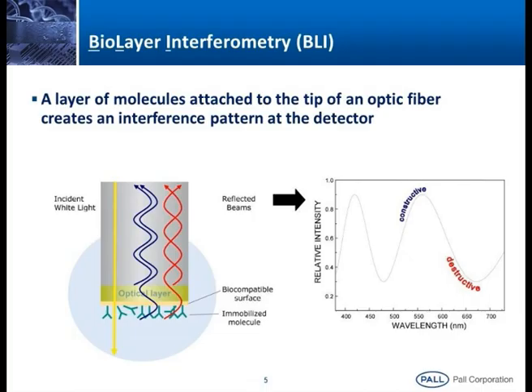One of the lights comes from the internal optical layer. When we say interference, suppose I put one stone into water, you see waves, right? If I put two stones simultaneously into the water, what happens? Waves go to that side, but on this side they mix with each other. That is what we call interference. Here, due to the biocompatible matrix, there is always a kind of block, and some light gets reflected back.